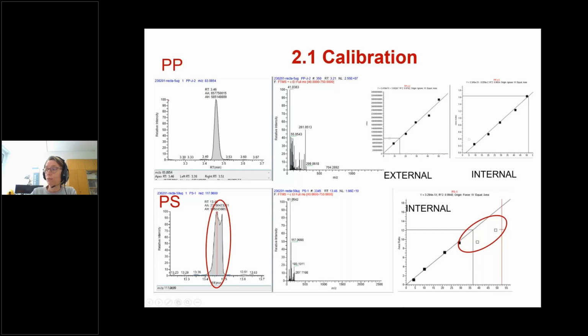So it means that we have to go down on this line. And with our system, we cannot weigh amounts lower than 5 micrograms. So it was good to hear that there are standards at a very low concentration, because we know that the compound is saturated, so therefore we cannot calibrate the system properly.